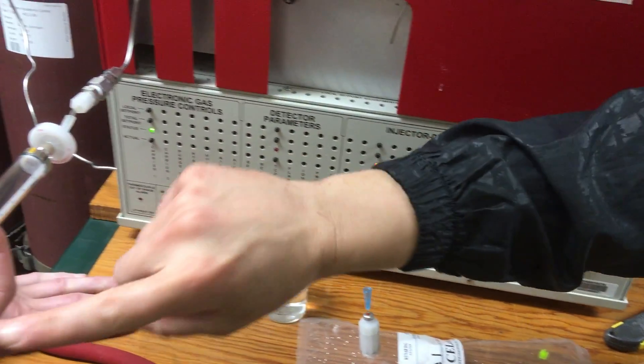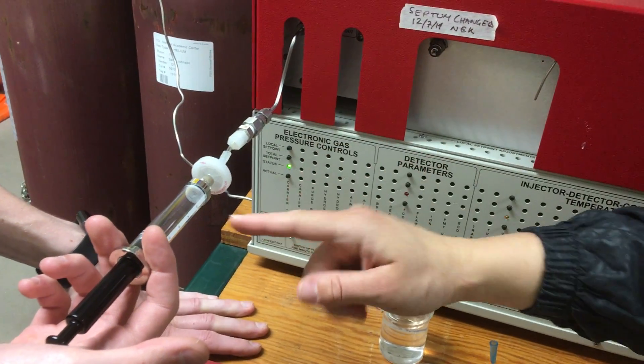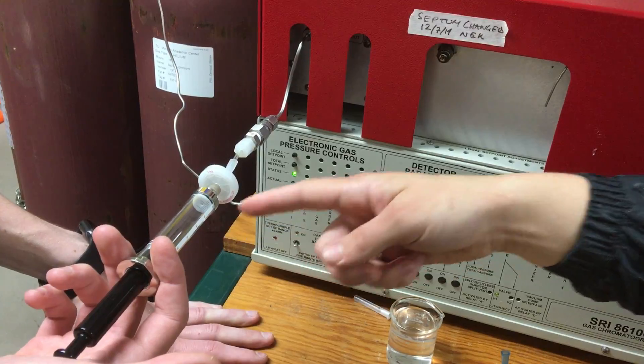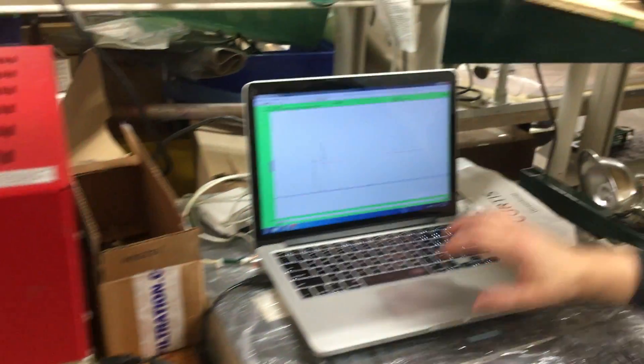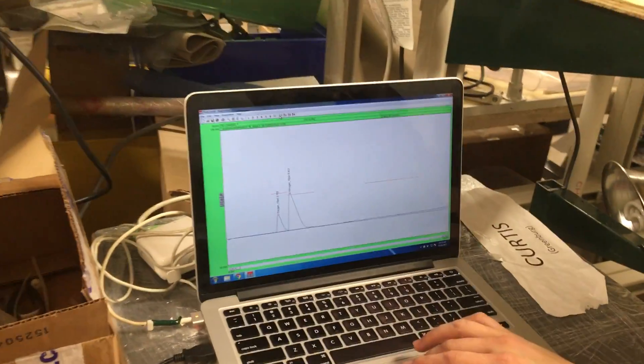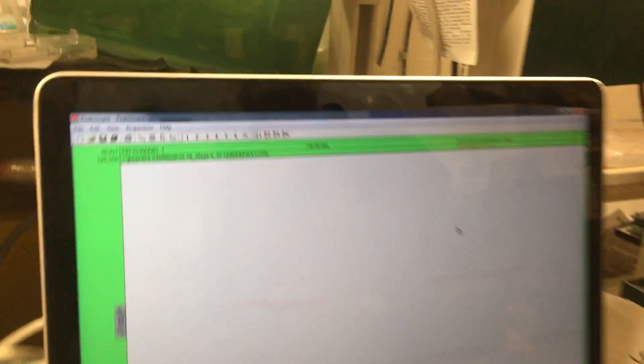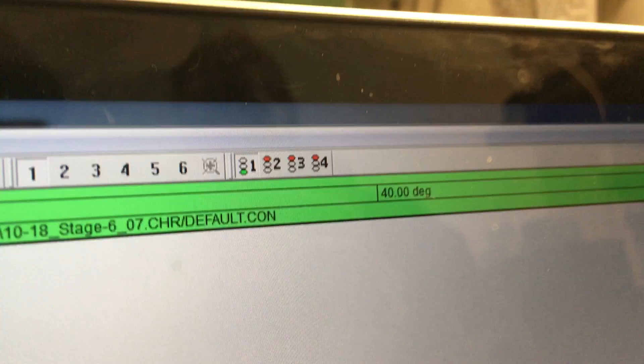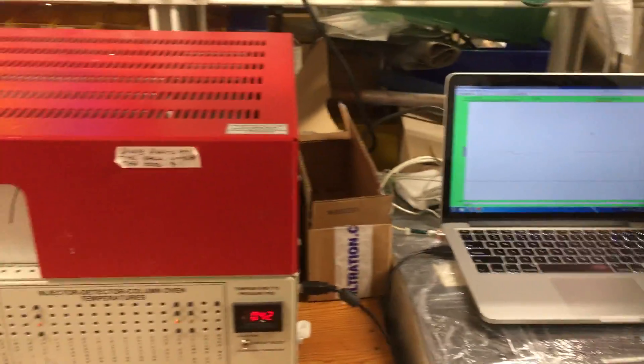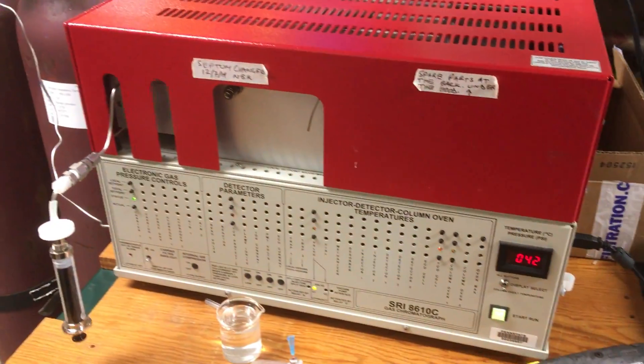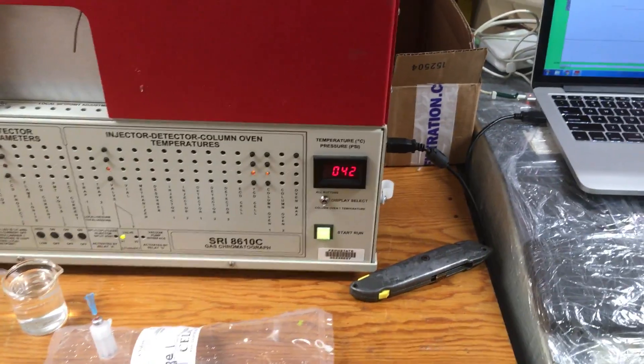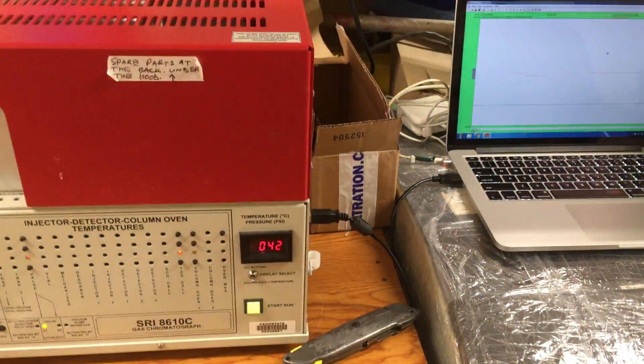And so we'll pull 10 mills, flush it, pull another 10 mills, and then Declan will flush it. And then when it gets to about the last one or two mills, we'll press the start button over here. So he's gonna flush it and he's gonna tell me when to close it, and we'll probably stop recording.